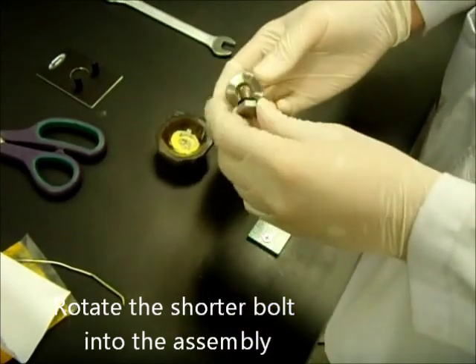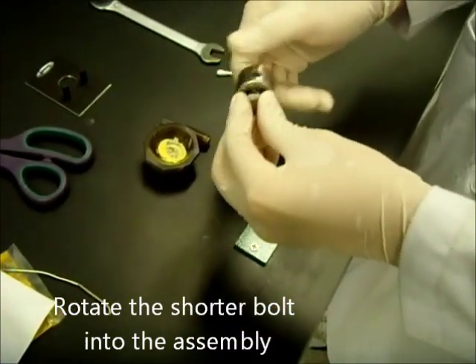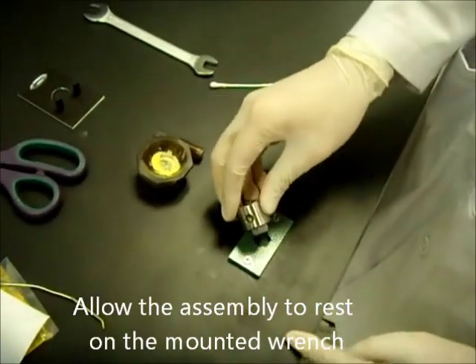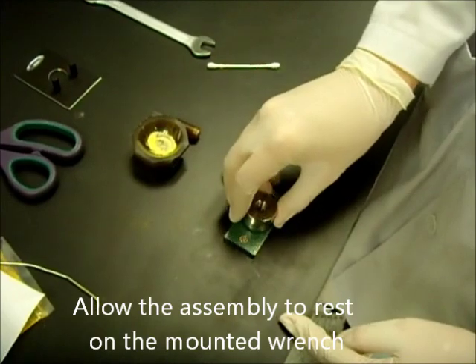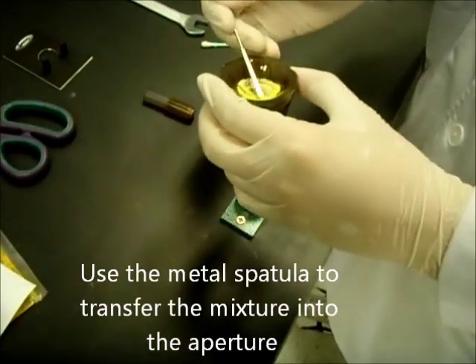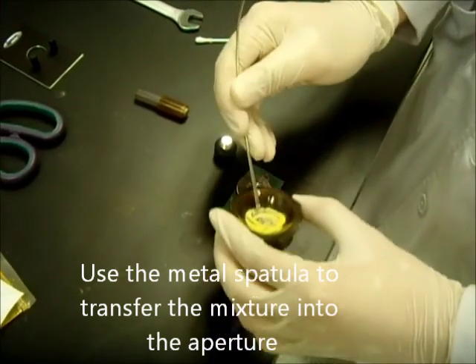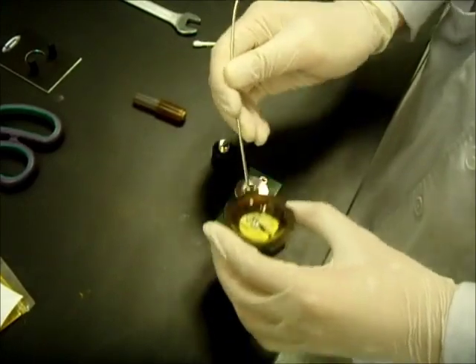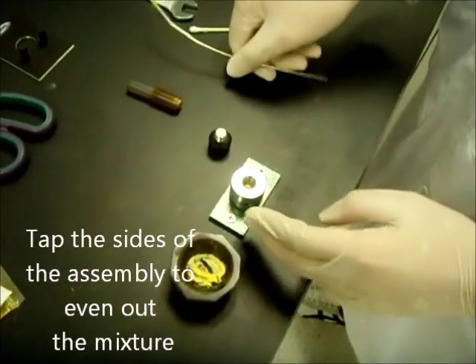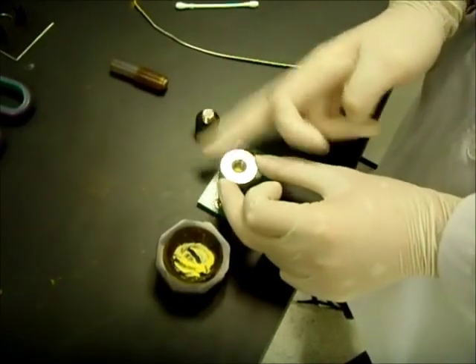Once ready, rotate the shorter bolt into the sample assembly. Make sure that it is all the way in, and let it sit nicely onto the bench-mounted spanner. Transfer the ground KBr into the cavity using a metal spatula. Make sure that it is evenly spread. Tap the sides of the sample assembly to get an even distribution of the solids in the aperture.